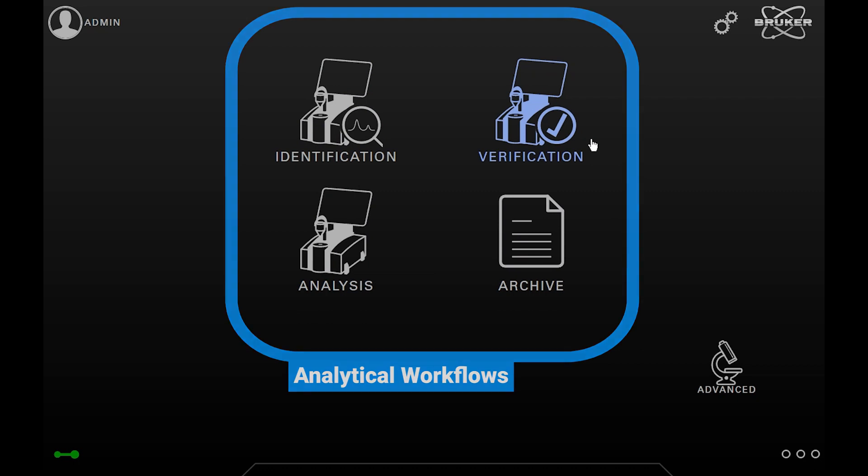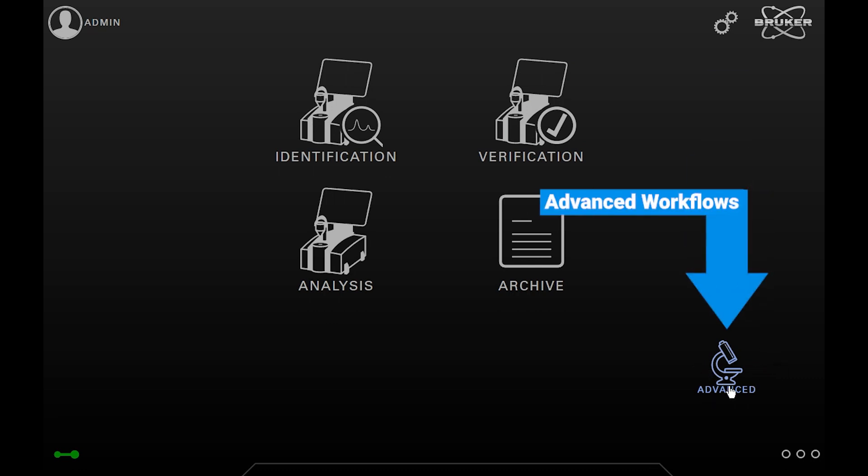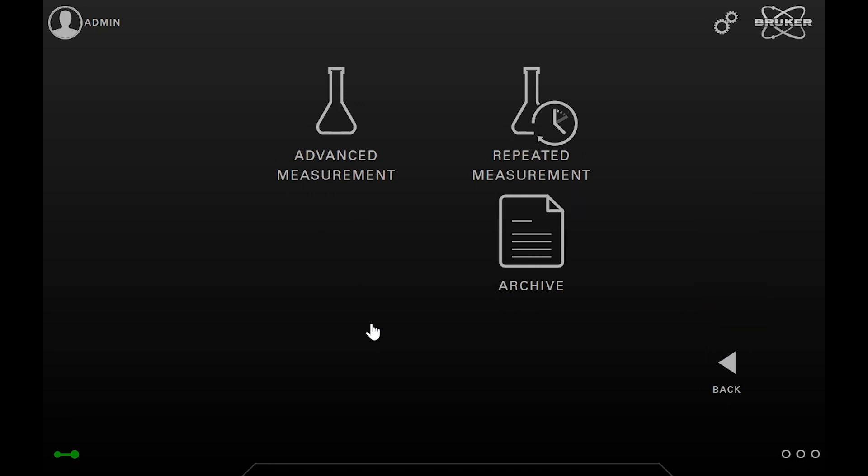In most home screens, we have also the possibility to switch to a second page—in this case the advanced page—where additional functions are available. Now you know all the features of the OPUS Touch home screen.